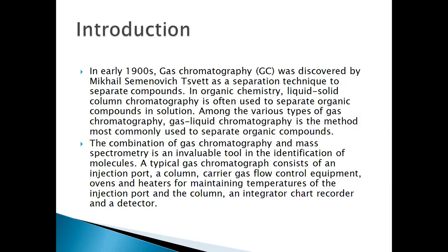There is an introduction of gas chromatography. In the early 1900s, gas chromatography was discovered by Mikhail Semyonovich Tsvet. It is a separation technique to separate compounds. In organic compounds, liquid solid column chromatography is often used to separate organic compounds in a solution. Among the various types of gas chromatography, gas liquid chromatography is the method most commonly used to separate organic compounds.